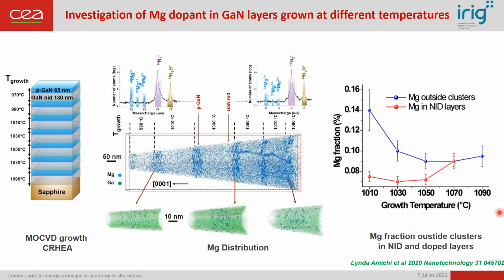And this is a relevant result because it can be directly related to the activated dopant that can be measured by other techniques such as electron holography. And if you want more details about this correlation, you can find an answer in this paper.